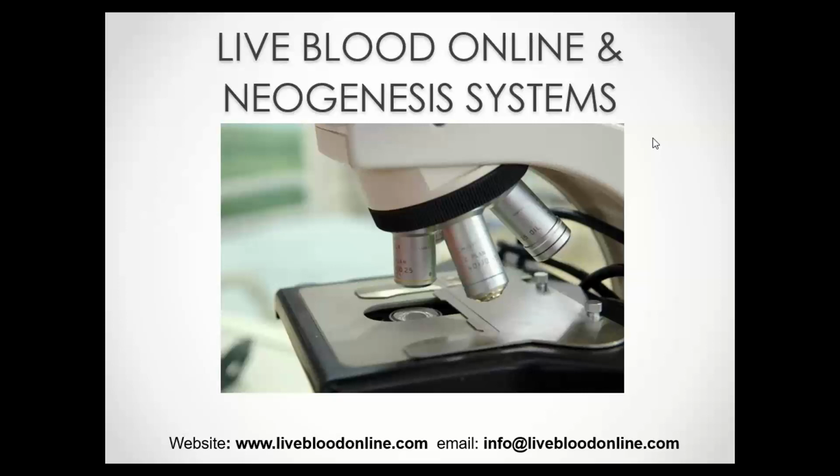Now it is important to mention though that not all dark field microscopes are suitable for live blood analysis. Dark field itself is a technique that is used in microscopy. It's not unique to live blood analysis. So there are many dark field microscopes available from microscope suppliers, but most dark field microscopes are not suitable. And also many microscopes that are sold as dark field live blood analysis microscopes are also not suitable. Now this is because there are a very particular set of specifications needed in a microscope to make it suitable for analyzing live blood in dark field.